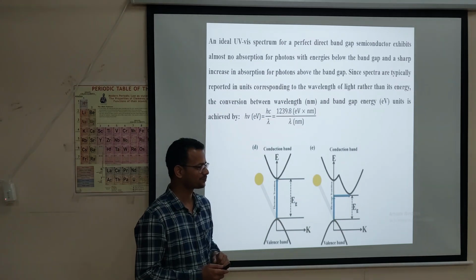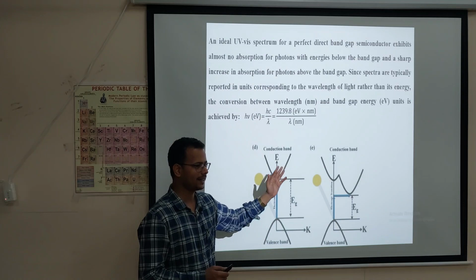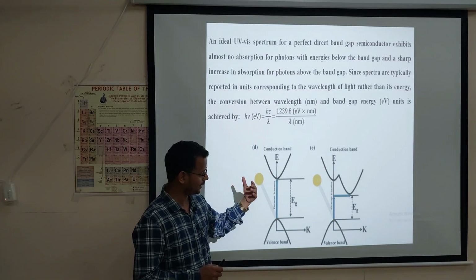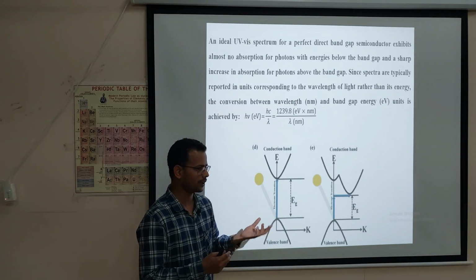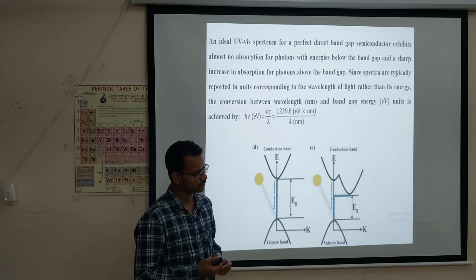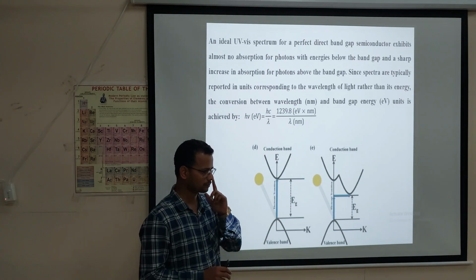Okay. Then what is the difference between direct band gap and indirect band gap? It is all about that. Okay. But in a later case we will get whether the material shows a direct band gap or an indirect band gap. I will show you an example here. I will tell you, you just wait for 1 minute. When I go to the slide, I will tell you. Okay.